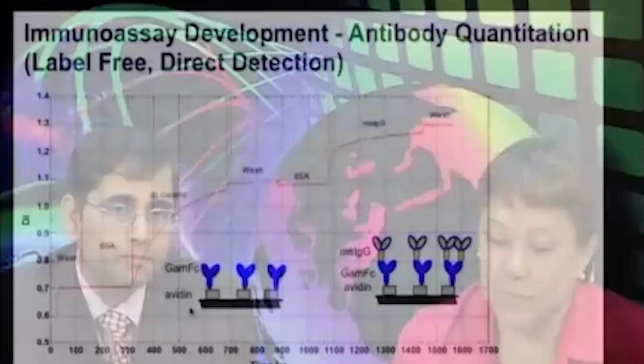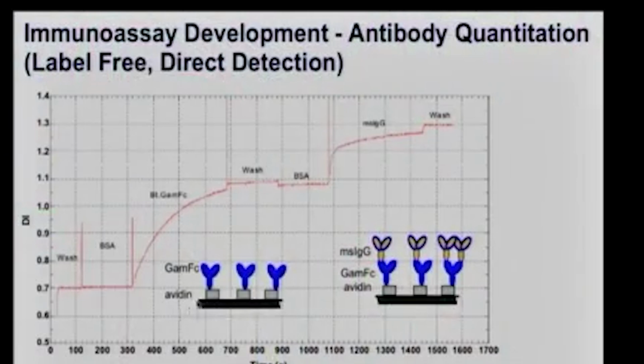So, in fact, the challenge with cells is we have to redesign the lines, because the lines we originally have are about 1.5 microns. Cells are bigger than that, so we have to redo the whole thing with a much bigger line. So a different setting has to be used. But it's the same principle, and in fact, it's very simple to detect cells. Sure. Yeah. This example is again an antibody immunoassay, so you can play games on that.